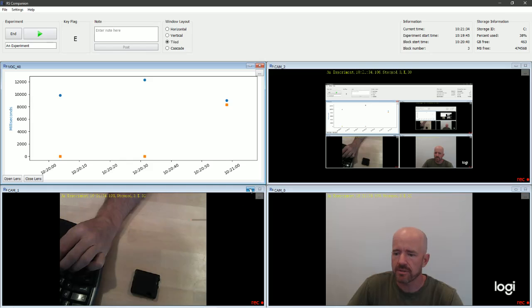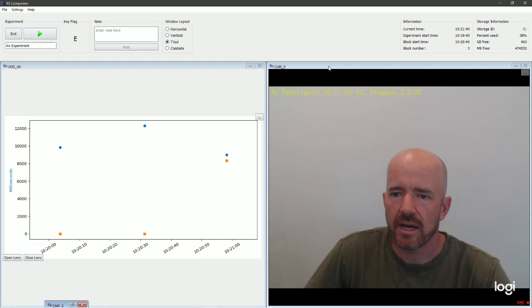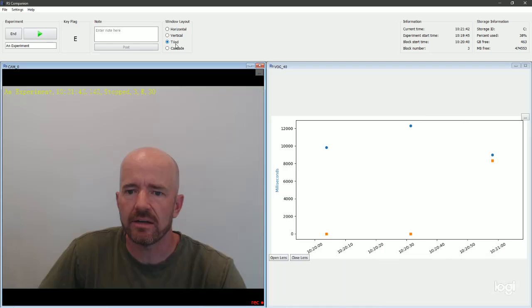All sorts of options here. Minimize some windows. We tile. If we click on a window and hit tiled, that window then goes to position 1, so we can arrange it how we like. When we close out the user interface, it'll reopen in the exact same window configuration that it was left in.